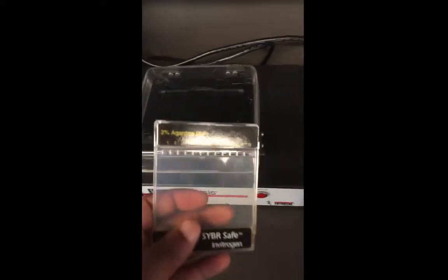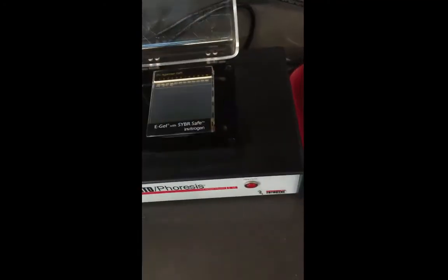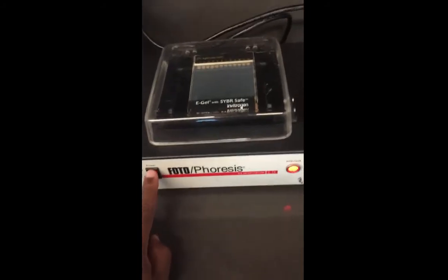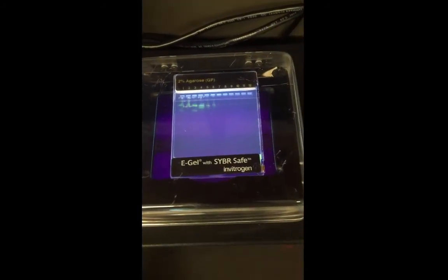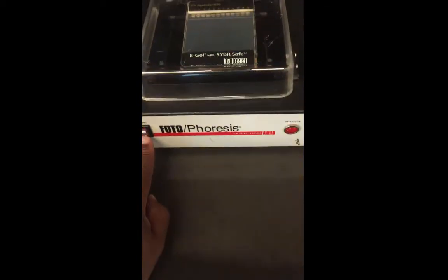So you put the E-Gel cartridge into the machine then you close the lid and you turn the switch on to expose the UV light and you can take a picture of your DNA bands there. Be careful not to stare into the light because UV light can be damaging to your eyes with long-term exposure.